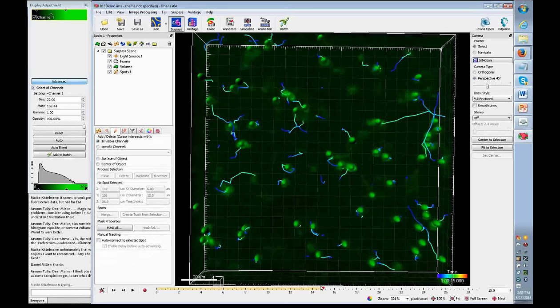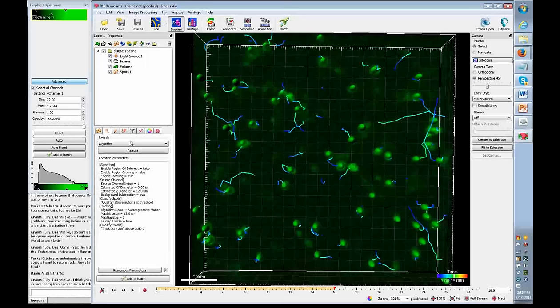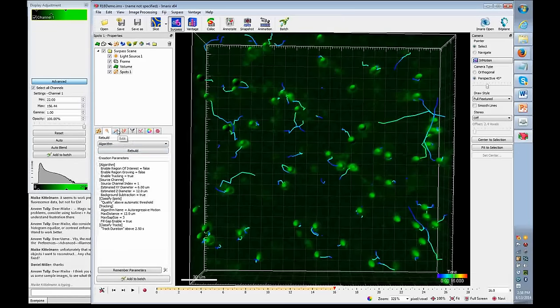Oh, Kevin, can you be sure to show drift correction? Yes, I can show drift correction. It will be a little bit odd on this data set. It will be kind of a forced application since there doesn't seem to be any drift here, but it will get the message across nonetheless. So we can definitely show that example.